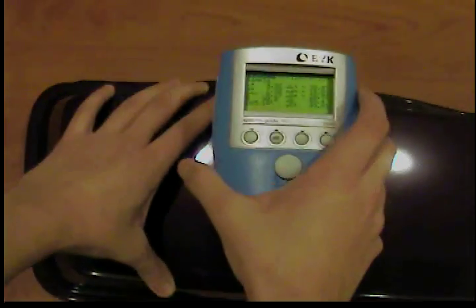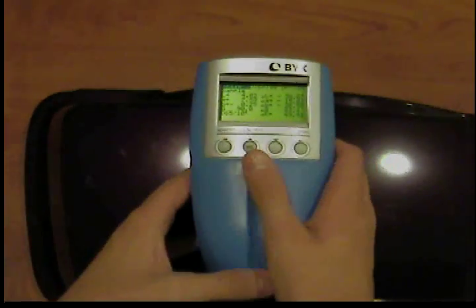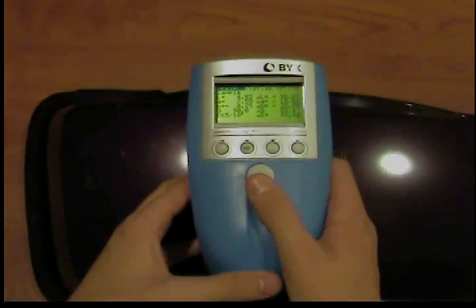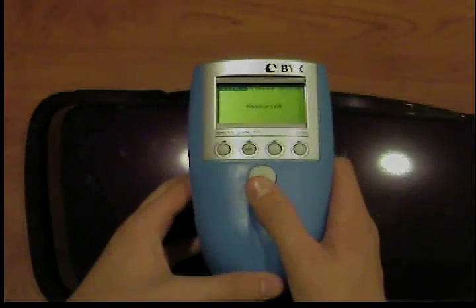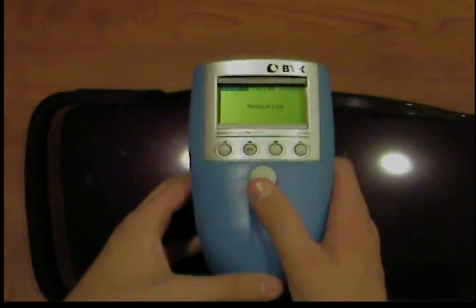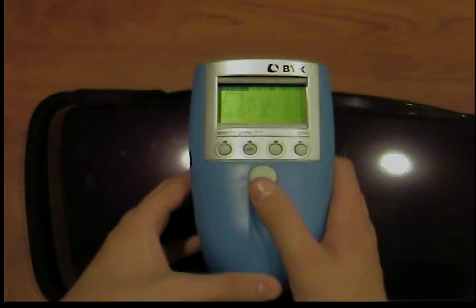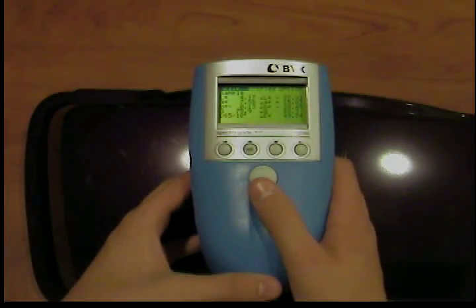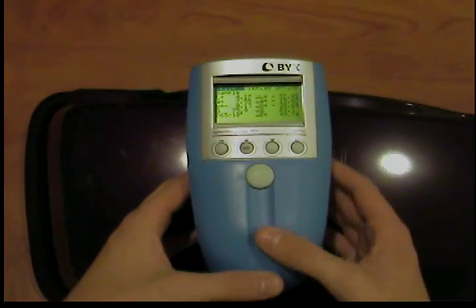Set the instrument on the sample to be measured. Now press the operate button to start measuring. The beep indicates the measurement has been completed.